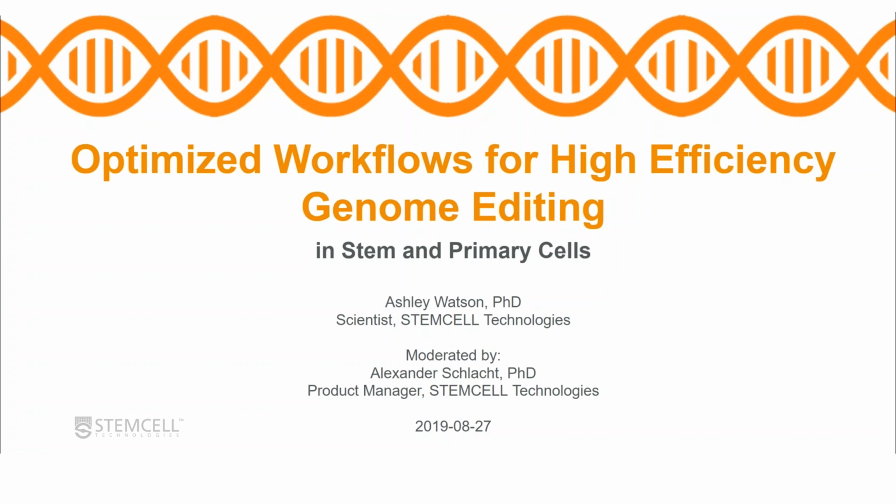Then I'll go into how it's being applied in more complex culture systems such as STEM and primary cell types, and some of the challenges associated with applying this tool in these systems. Then I'll go into some specific examples related to editing in human primary immune cells and human pluripotent stem cells, and how STEMCELL Technologies is approaching these challenges.